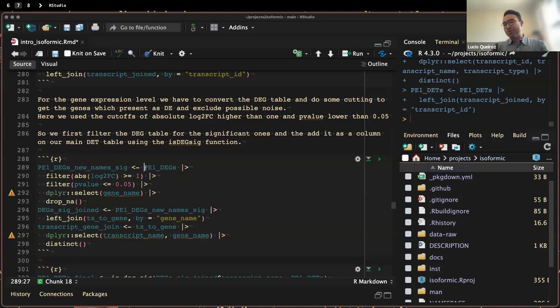Actually, this is the opposite of the approach the Bioconductor project aims for. Usually the Bioconductor project tries to get one data class, one object that contains all the data. We are thinking about optimizing our workflow to integrate all that, but we want to give flexibility. If you already have tables, because it's really common for people to have a lot of Excel spreadsheets on their computers, we also want to leverage that so you can create the objects from loose spreadsheets. And of course, implementing all the validation steps, so your tables actually have the same information. But we are thinking about which data class, such as SummarizedExperiment, can hold that kind of data better.